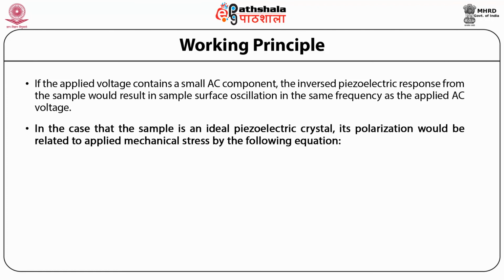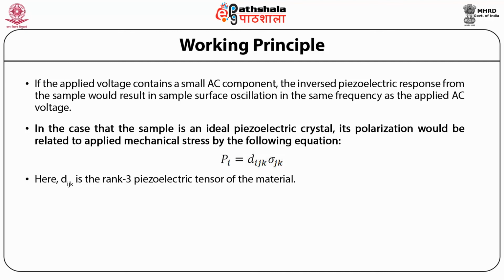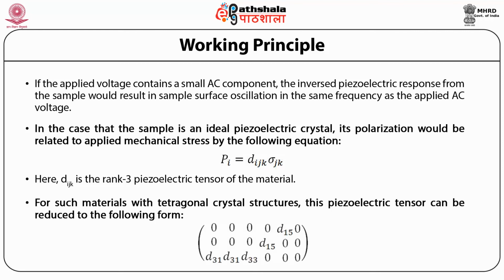In the case that the sample is an ideal piezoelectric crystal, its polarization would be related to the applied mechanical stress by the following equation, that is P_i equals d_ijk sigma_jk. Here d_ijk is the rank 3 piezoelectric tensor of the material. For such materials with tetragonal crystal structures, this piezoelectric tensor can be reduced to the following form.